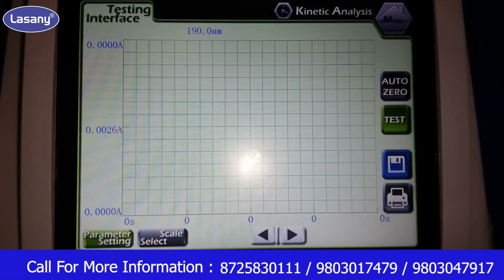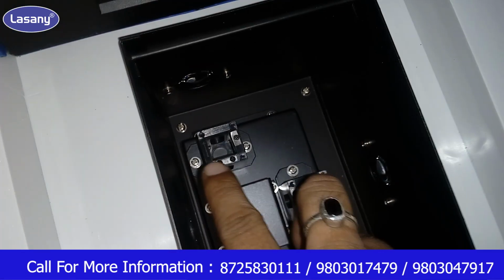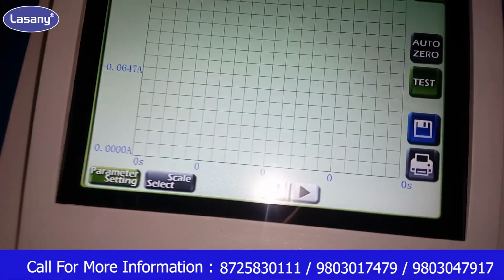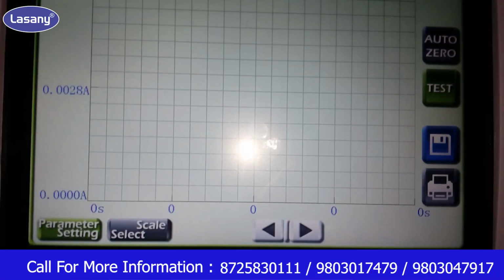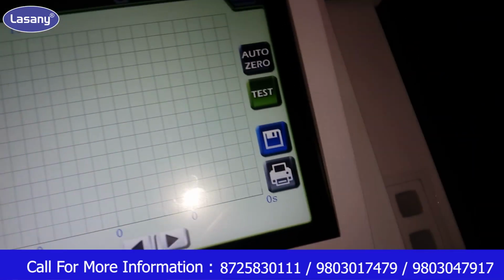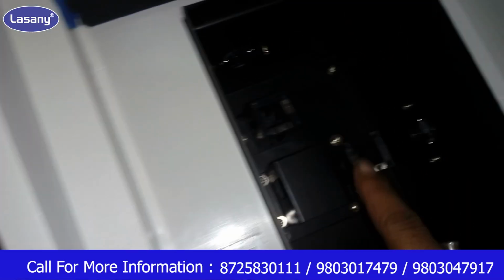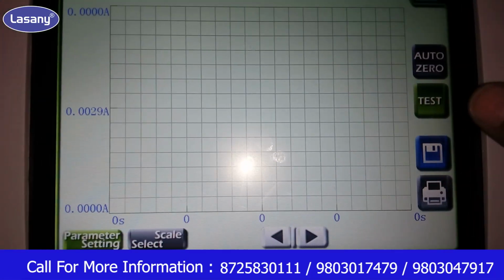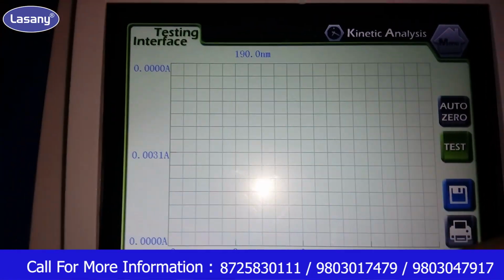The same procedure is here. Put your reference sample in both the holders. Click this auto zero button, and after that, calibration is done. Just replace your sample in this holder and click on the test button. It will show you the graph here.